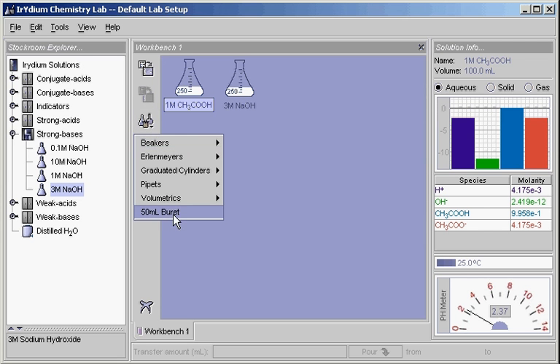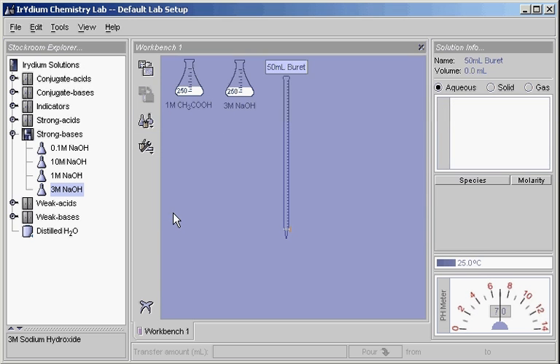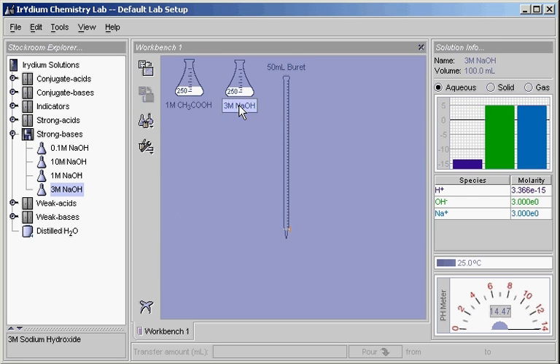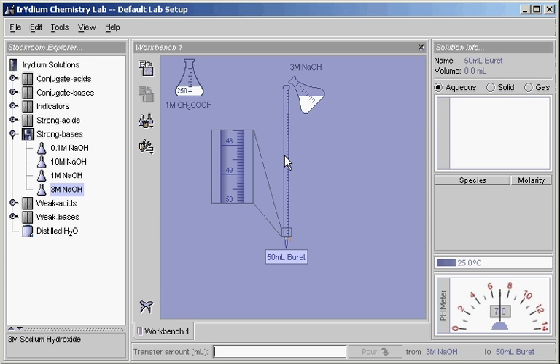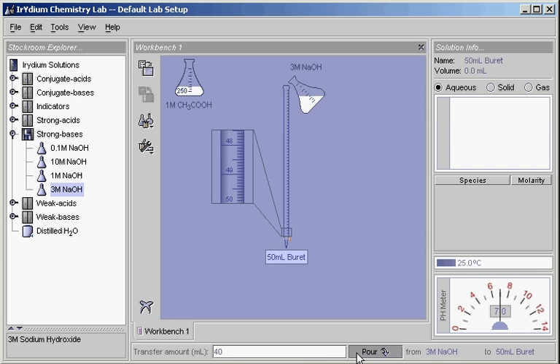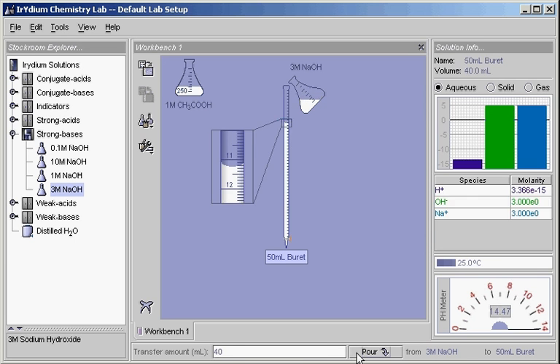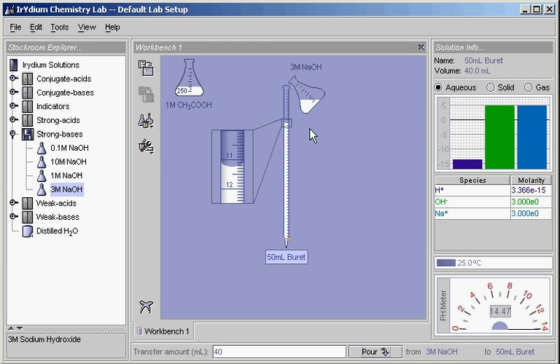It's a simple drag-and-drop to transfer solution from one piece of glassware to another. To show how to fill the glassware, we drag the flask onto the burette. Note that the transfer bar on the bottom is active. We'll pour 40 milliliters of sodium hydroxide into the burette, so we type the amount and click pour. The transfer bar always specifies what's being poured and into what container.